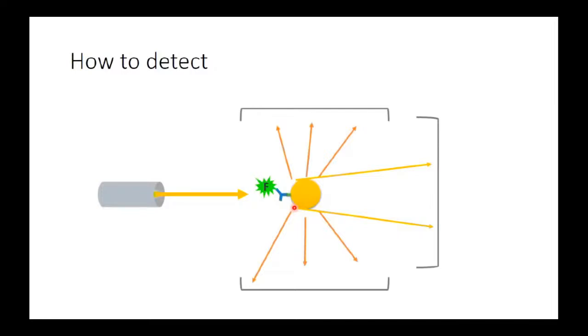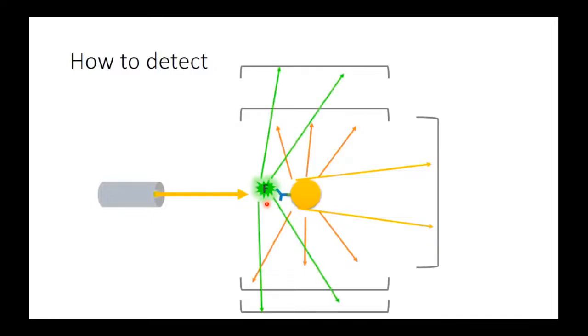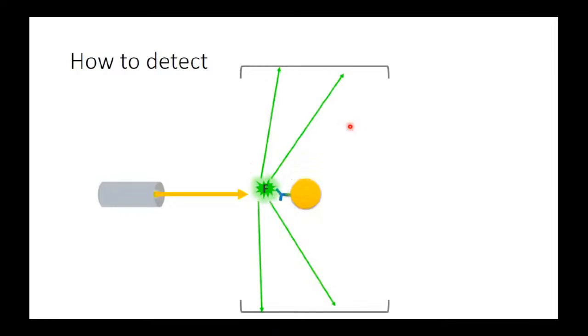And then when the fluorophore passes through the laser beam, the fluorophore will be excited, and then the fluorophore will emit light at a particular wavelength, and this light will be detected by the fluorophore detectors. All these detectors are connected to the computer, which is going to give me the exact data about every event of these three.